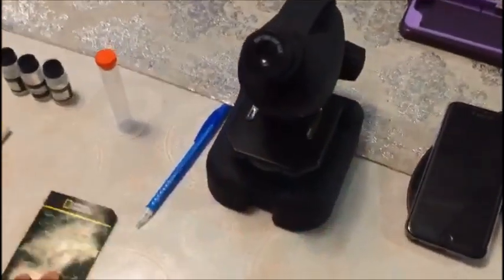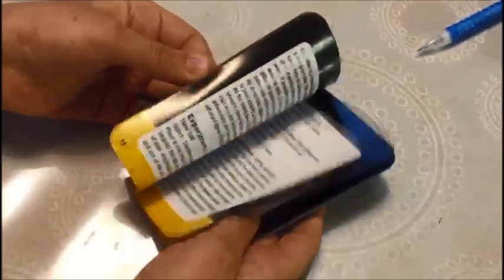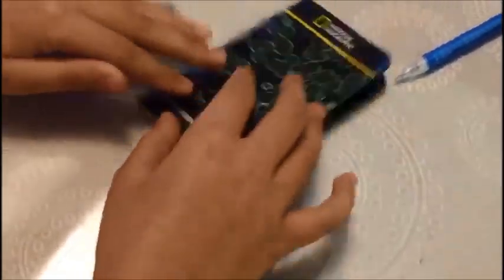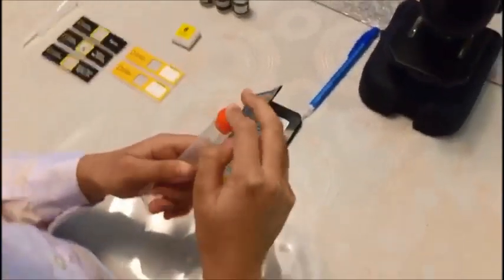It comes with this microscope and an experiment book which has lots of experiments inside, and also some tips. It has this test tube with its lid that pops up and pushes down.